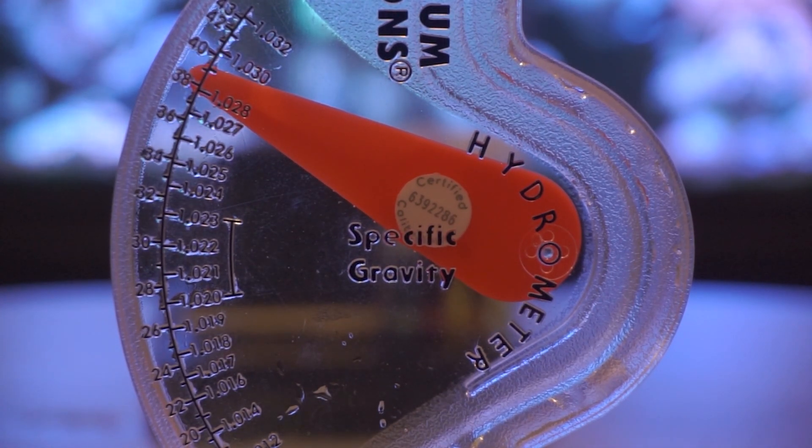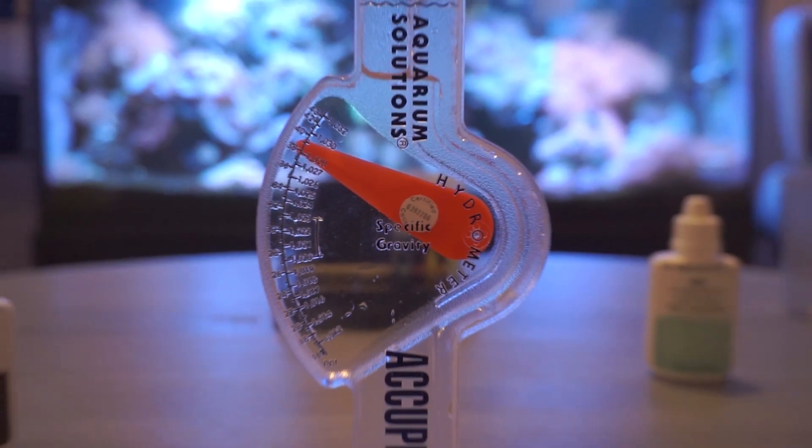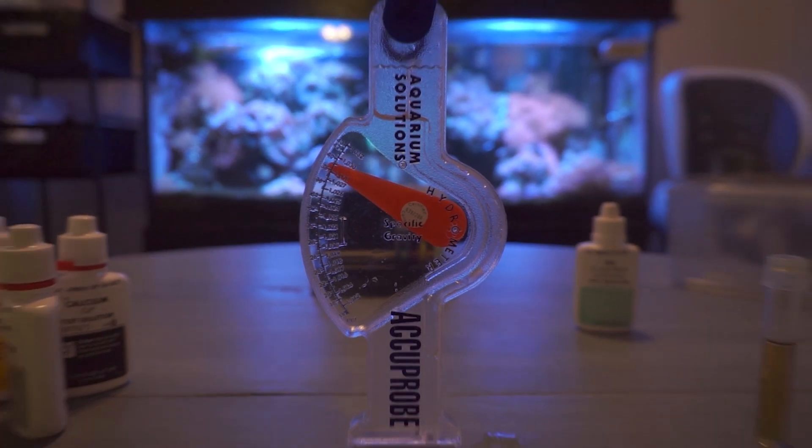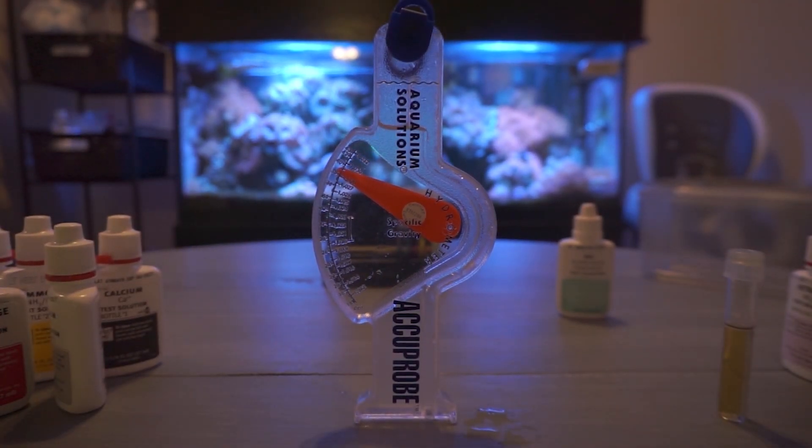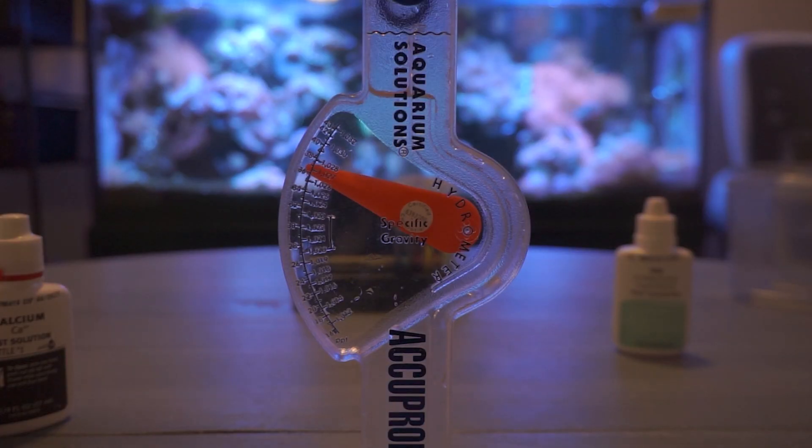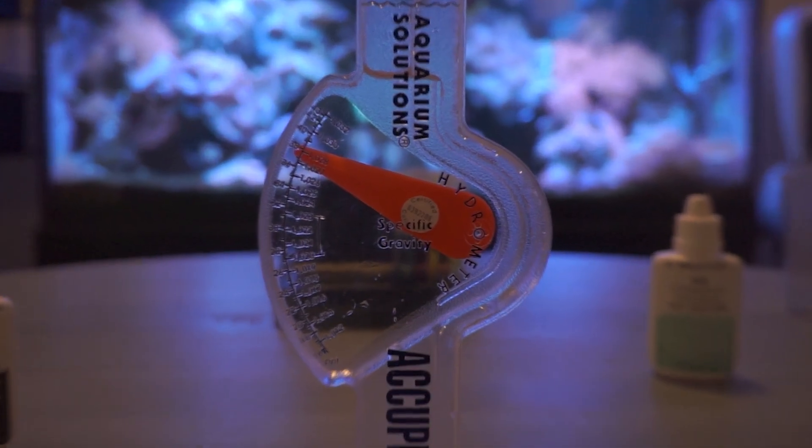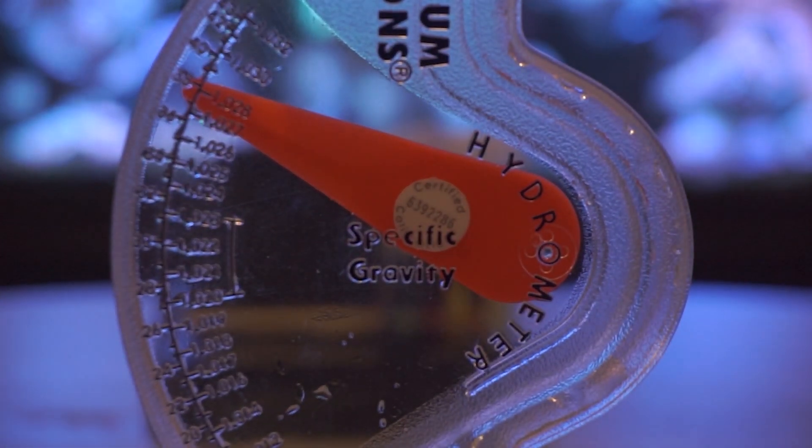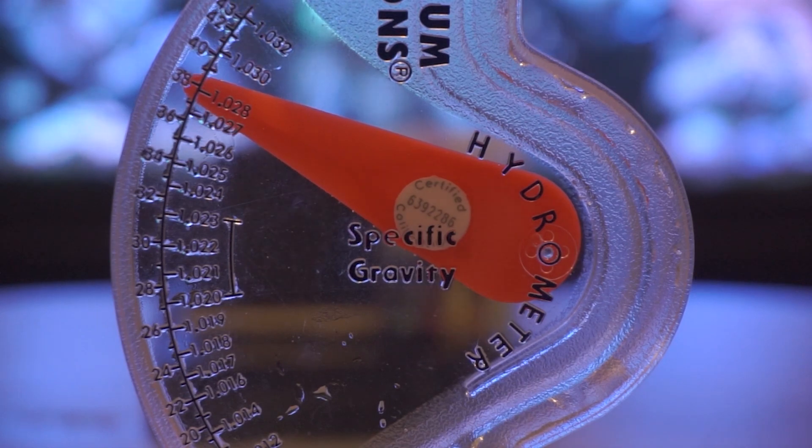Now another thing you can use is a refractometer to test your salinity. This is almost like a little telescope looking thing that you put a drop of water on. That will give you the most accurate salinity testing. They are very cool to use and they will give you a very accurate reading each time that you test your salinity.